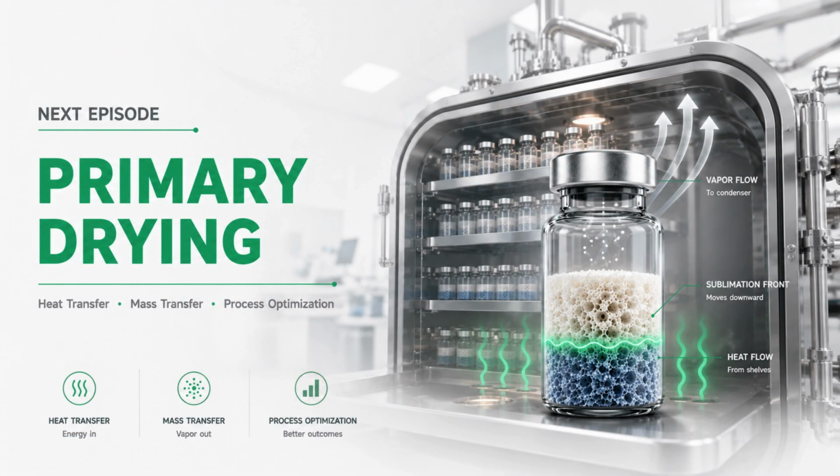In the next episode, we'll explore how heat transfer, mass transfer, and process parameters work together to control the entire primary drying process.